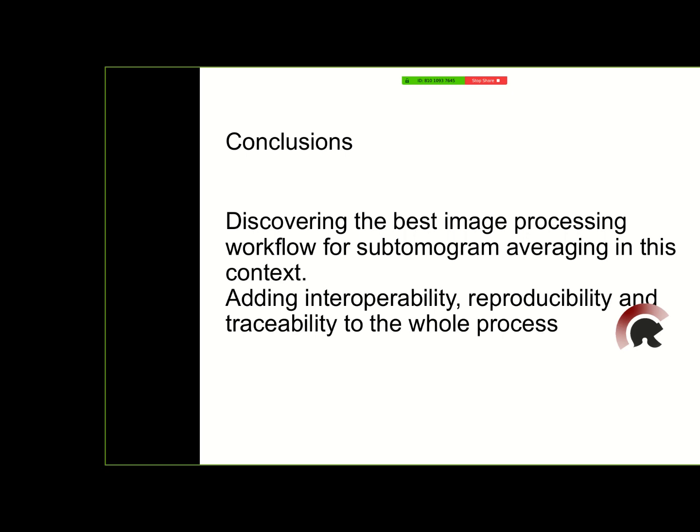And the other one is that you can now start to define consensus. For instance, you may perform a 3D classification using Dynamo, a 3D classification using EMAN or Relion, and only believe those classes that share a lot of supporting particles. All these classifications have a lot of false positives. Classes often get particles that really do not belong to the class. So by comparing the classification results from several programs, you are able to be more sure about your statements of what the different classes are in your structure, in your tomograms.